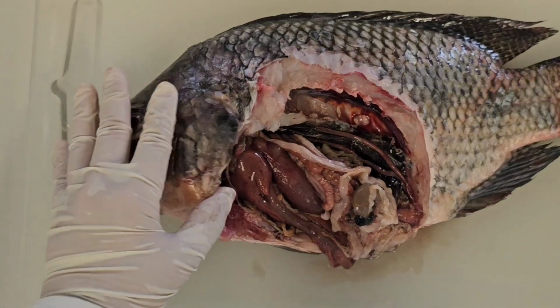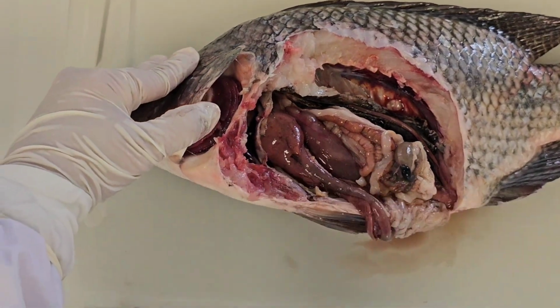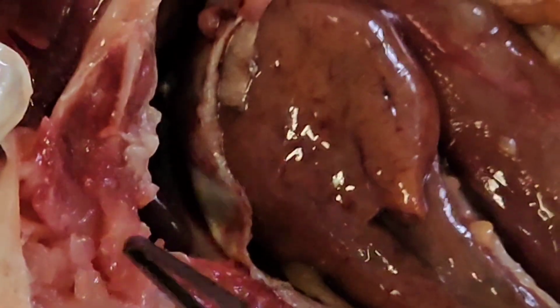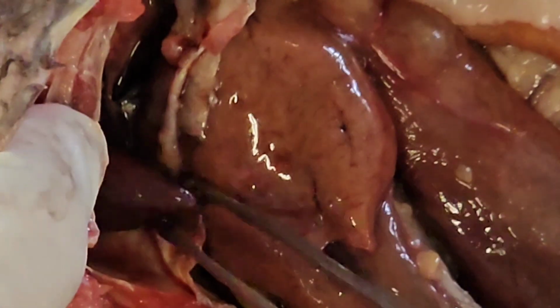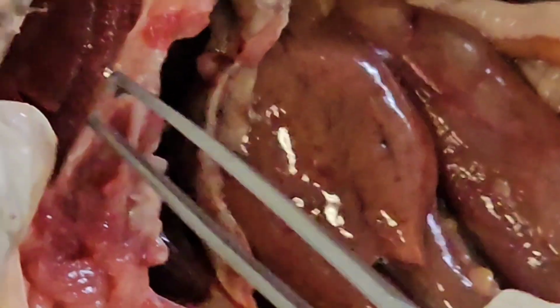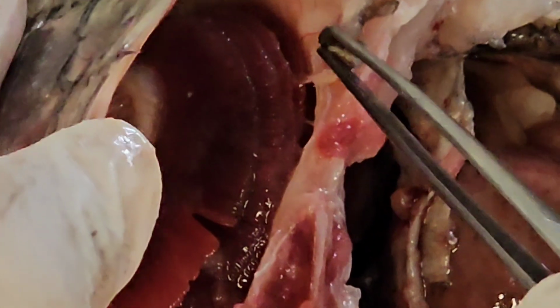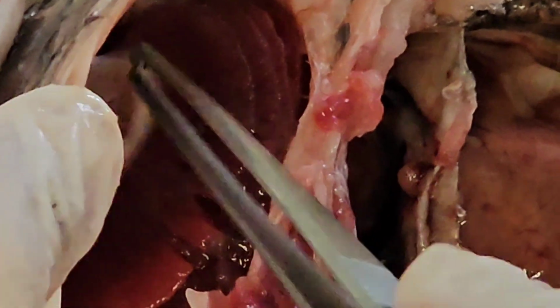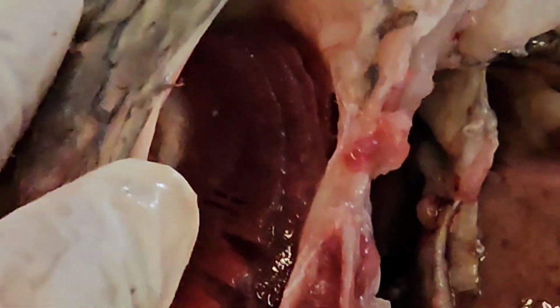Then for the next part, if you look near the operculum, I will zoom in more. You can see the heart of the fish is located near the gill. It normally pumps the blood into the gill for gas exchange. For the structure of the gill, you can see the gill arch and gill filaments.